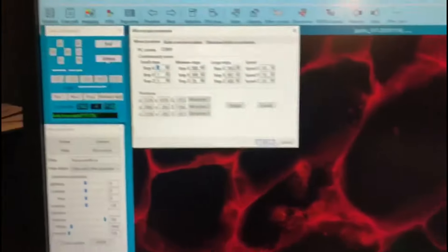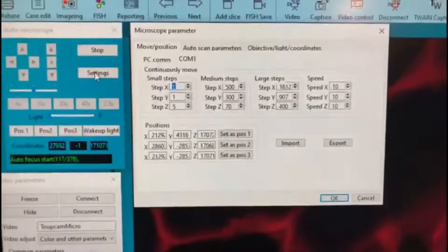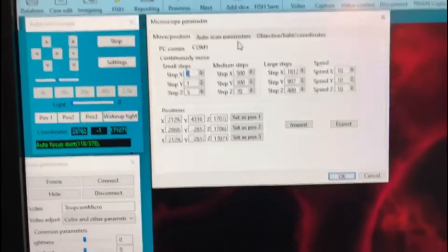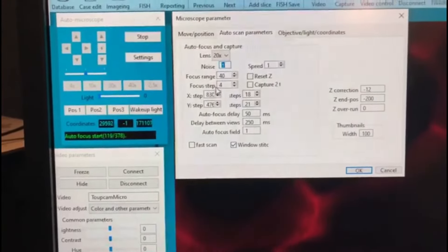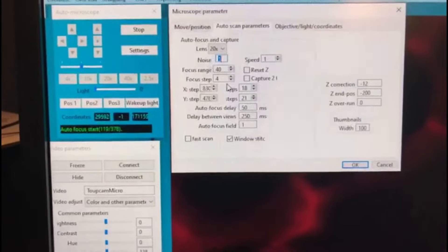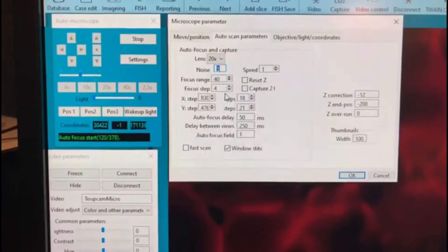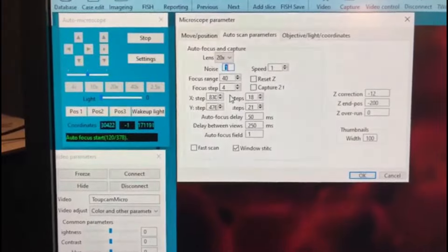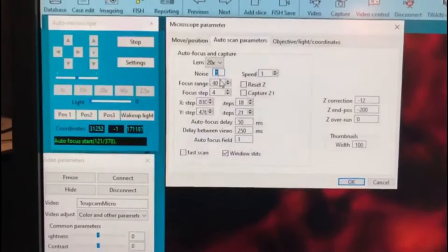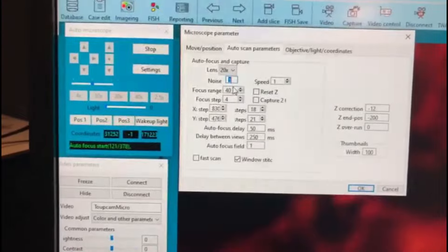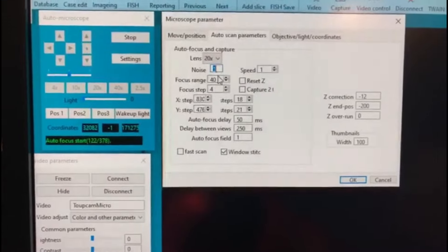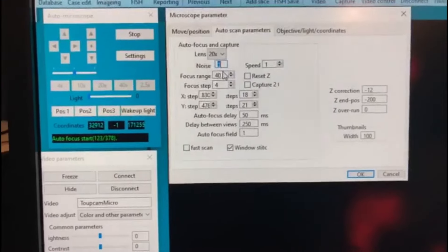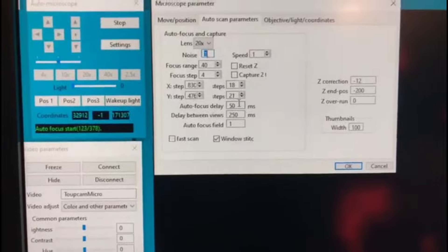In manual exposure mode, here are the specs for this experiment. We are using a 20x objective lens and we collect 10 focal points. Every plane has four steps jump, maximum 40 steps. In this case we have something around 0.31 micron size for each step.